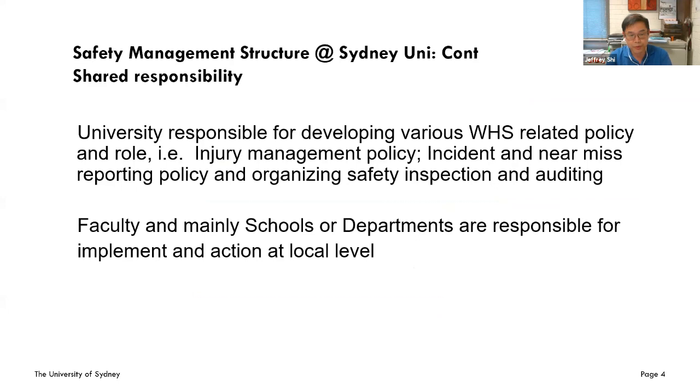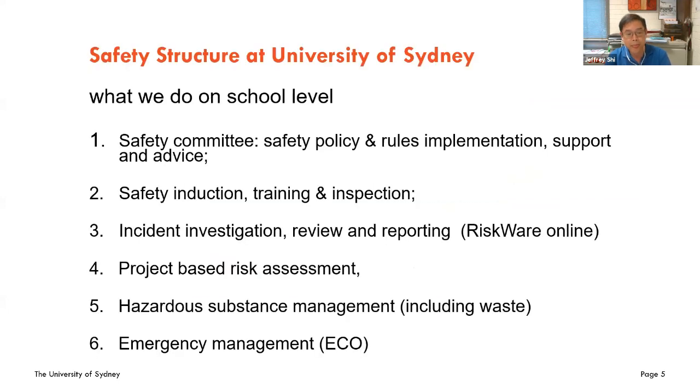What do I do in the school? The school has a safety committee that meets regularly, responsible for school policy, safety rules, implementation, and advice and support to all our students. We do safety induction for every newcomer: student, visitor, contractor, staff. And we do regular inspections in laboratories.